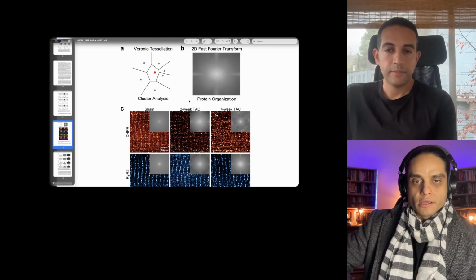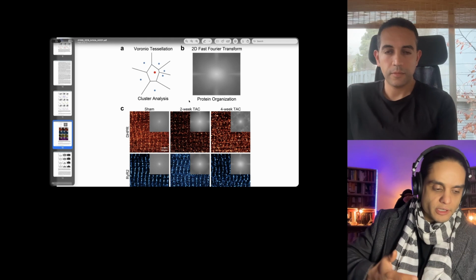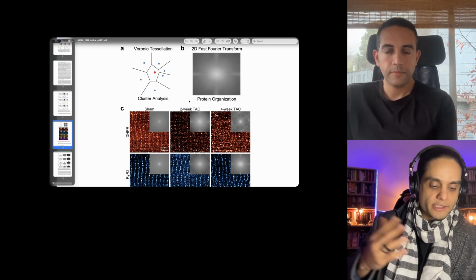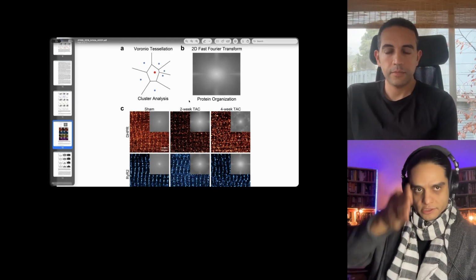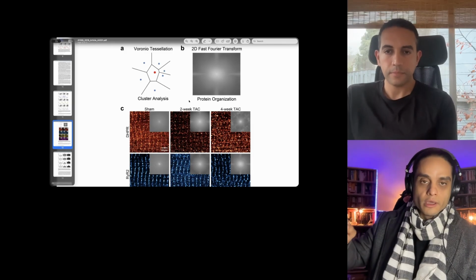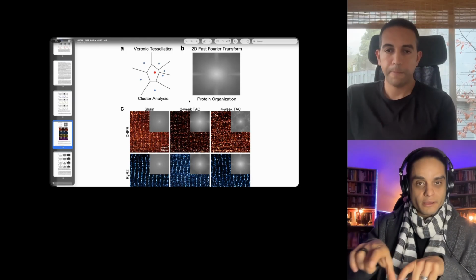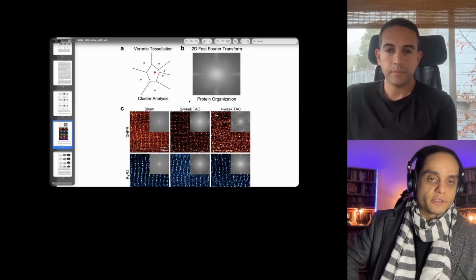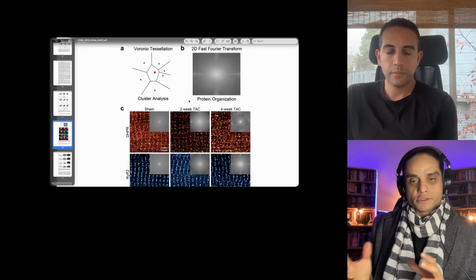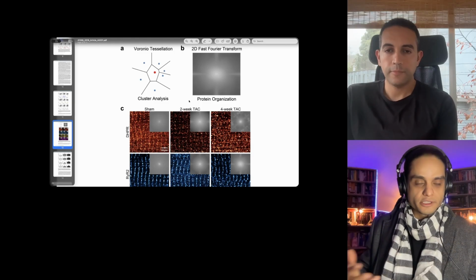I see. Just to give a little more context, if you have a fluorescent antibody, the light emitted is not a spike, it's a distribution of wavelengths. So if you have two different antibodies, there could be an overlap in the wavelengths, and that complicates everything. This is what we refer to as compensation. So it's way easier to do the antibodies sequentially than all at the same time.